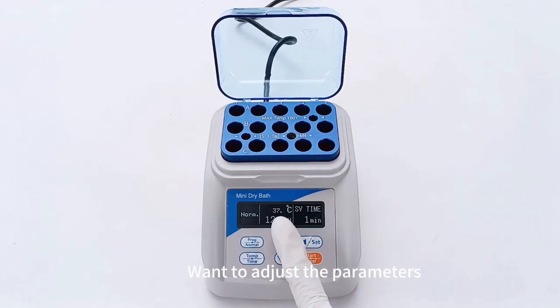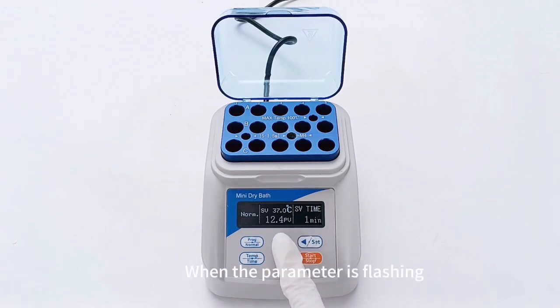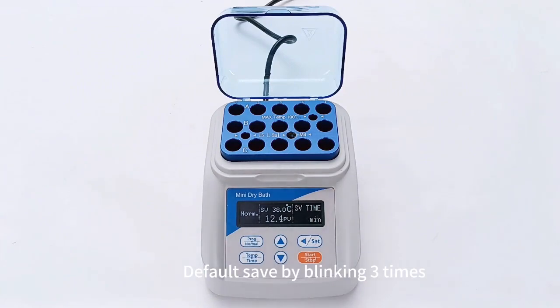Want to adjust the parameters? First press the lower left compound key, switch temperature and time. When the parameter is flashing, press set key to shift to the value to the corresponding unit. Press up and down again to adjust the value. Default save by blinking 3 times.